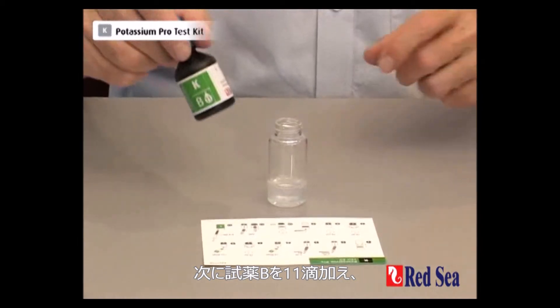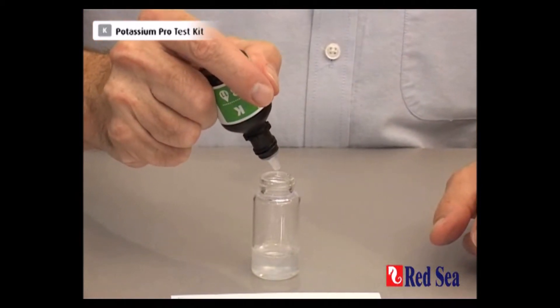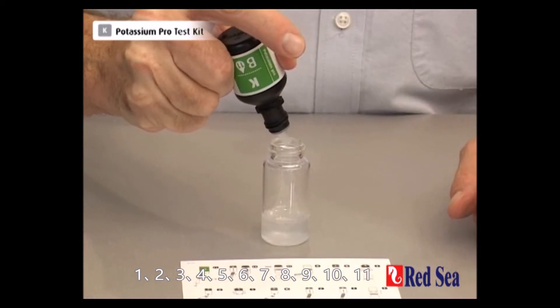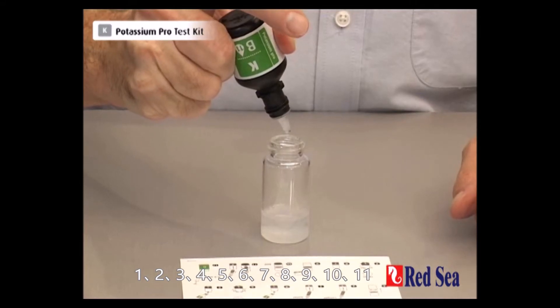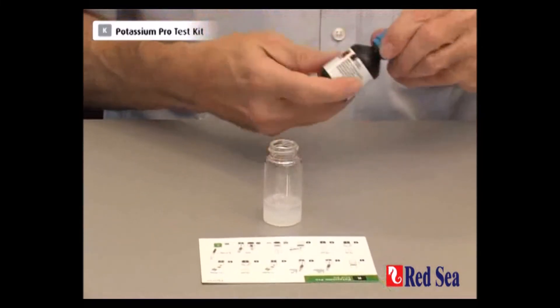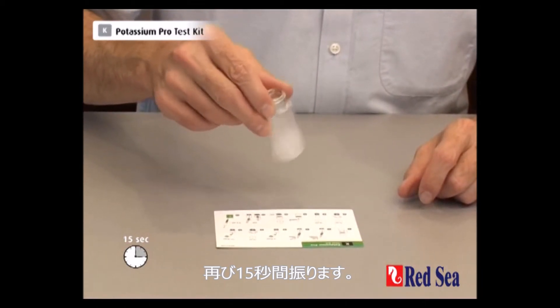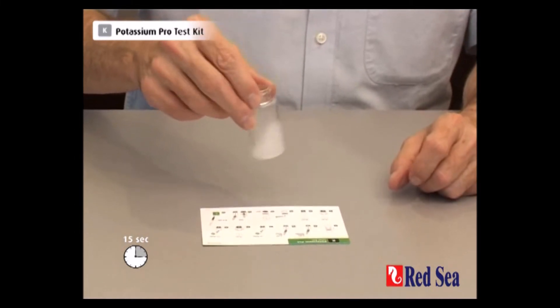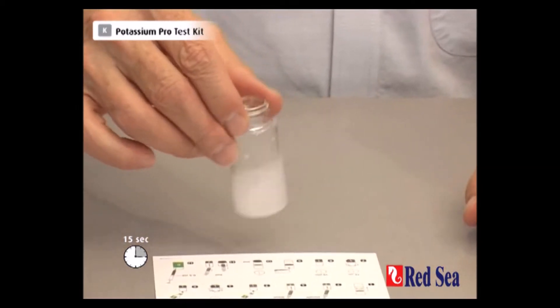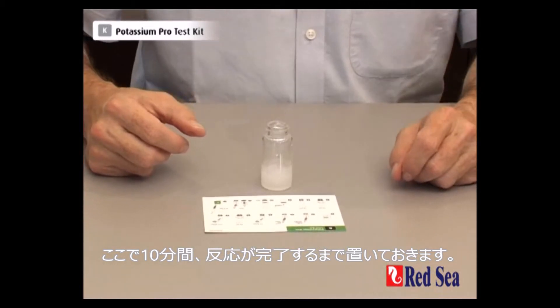We now add 11 drops of reagent B. Now we have to let that settle for about 10 minutes for the reaction to take place.